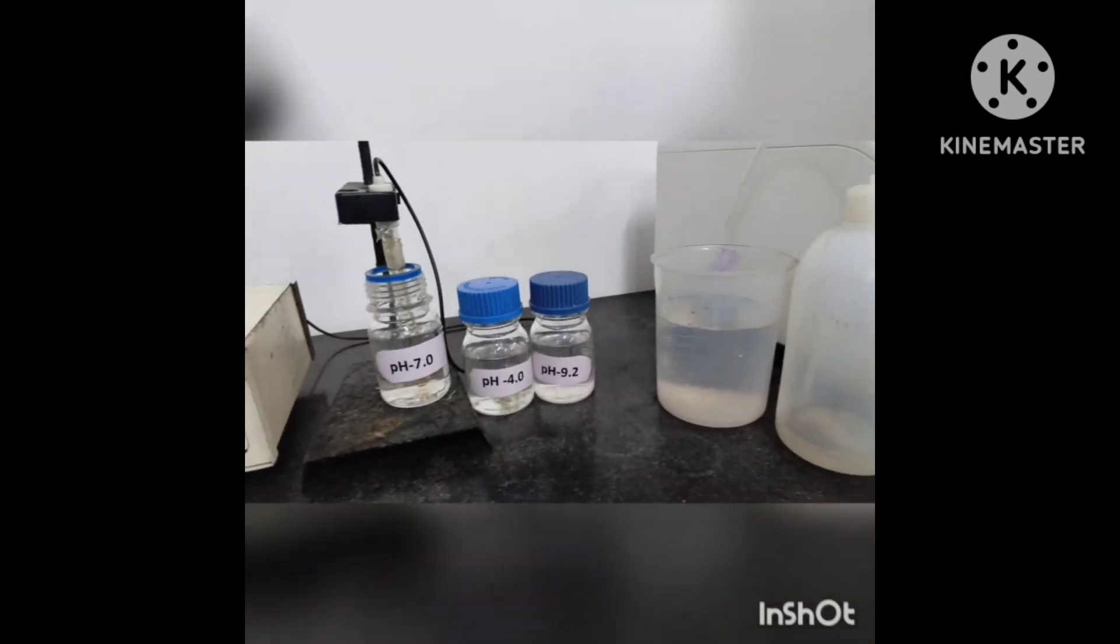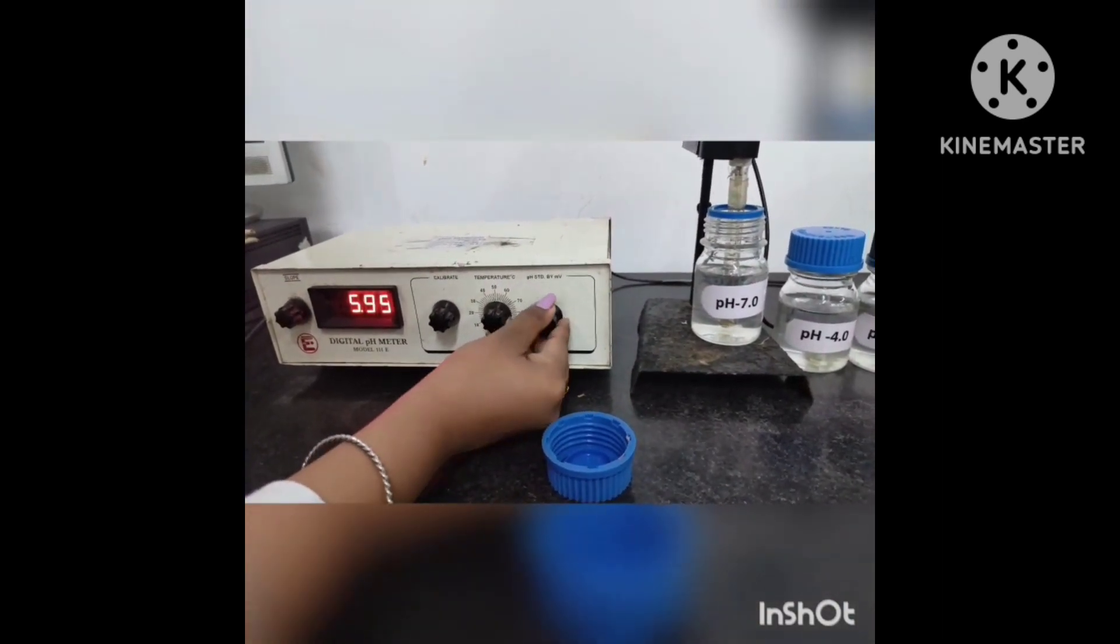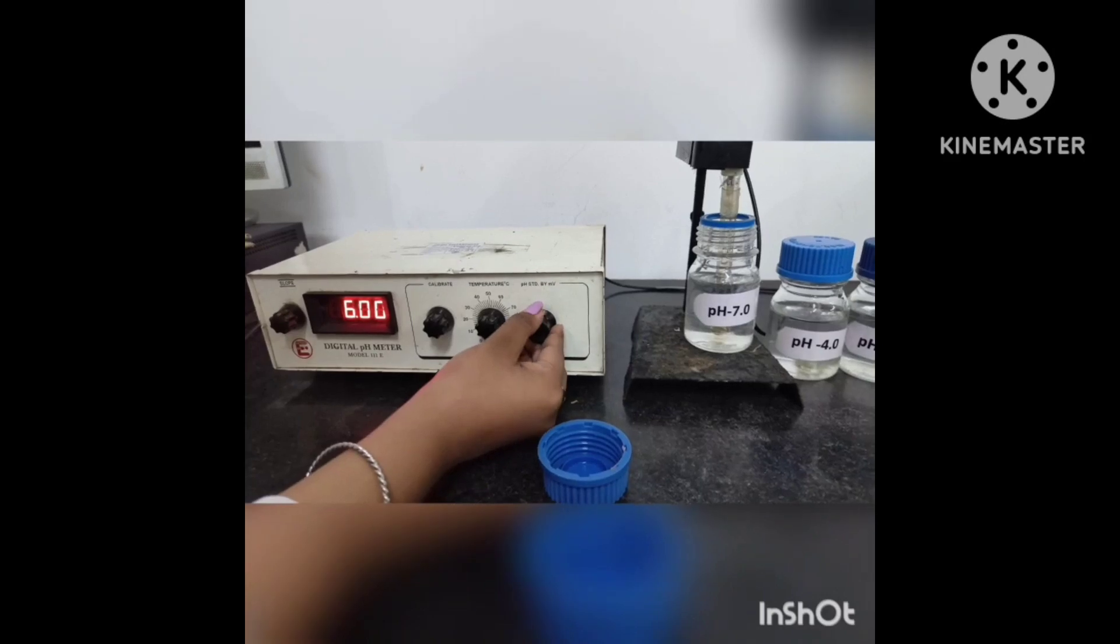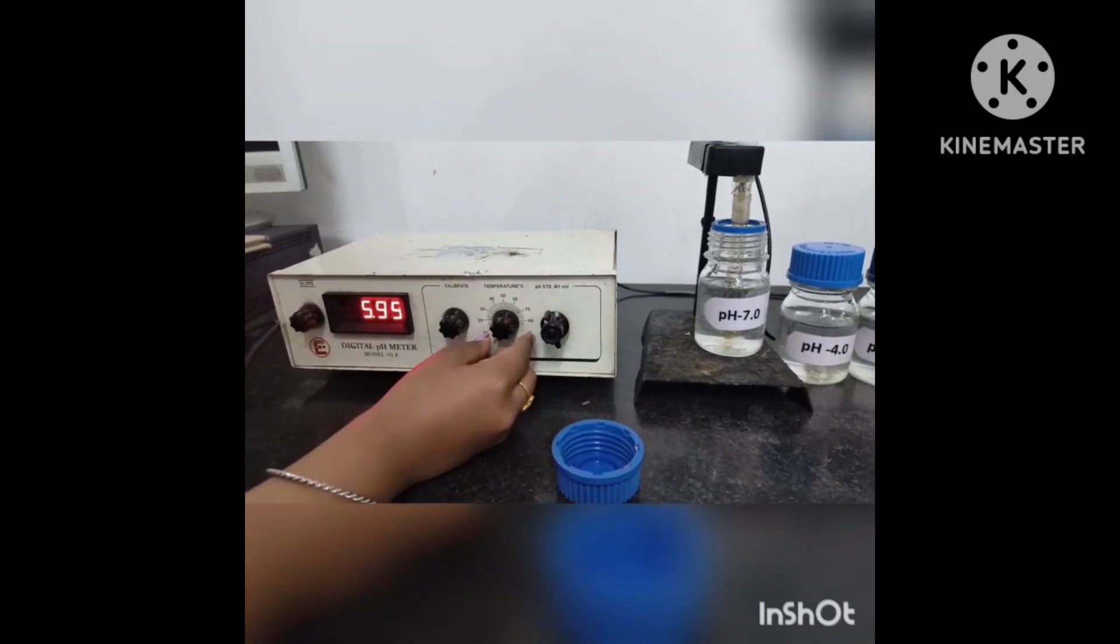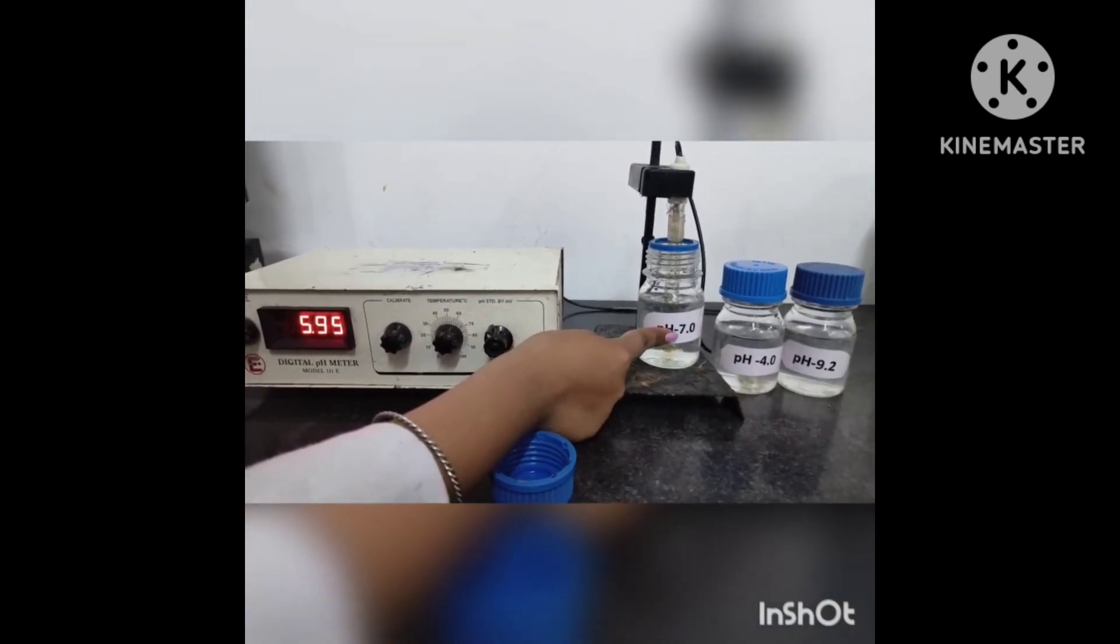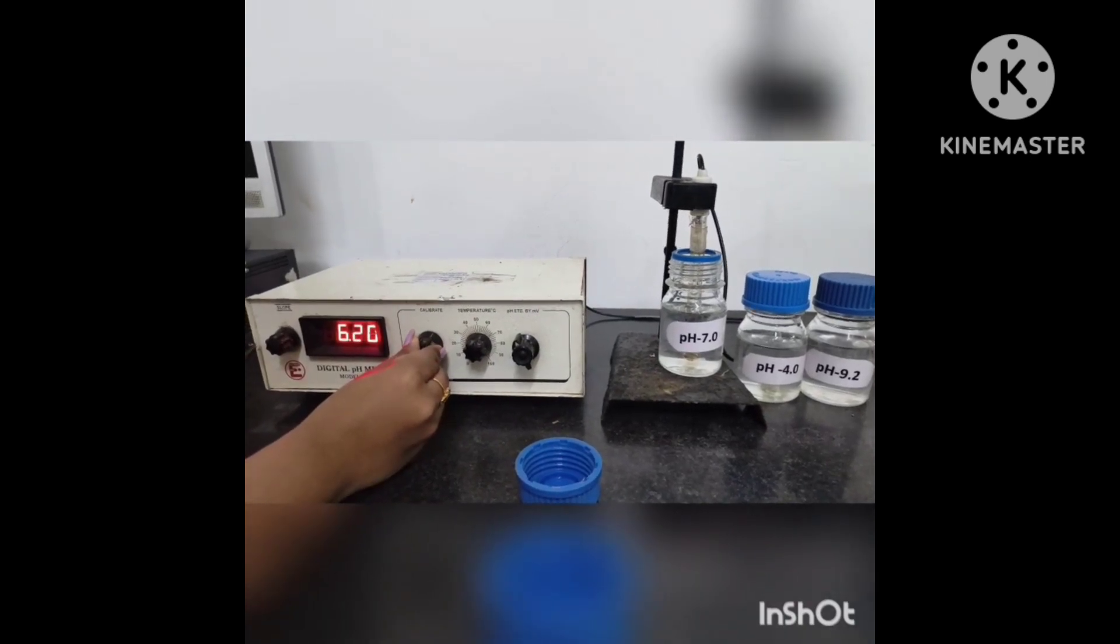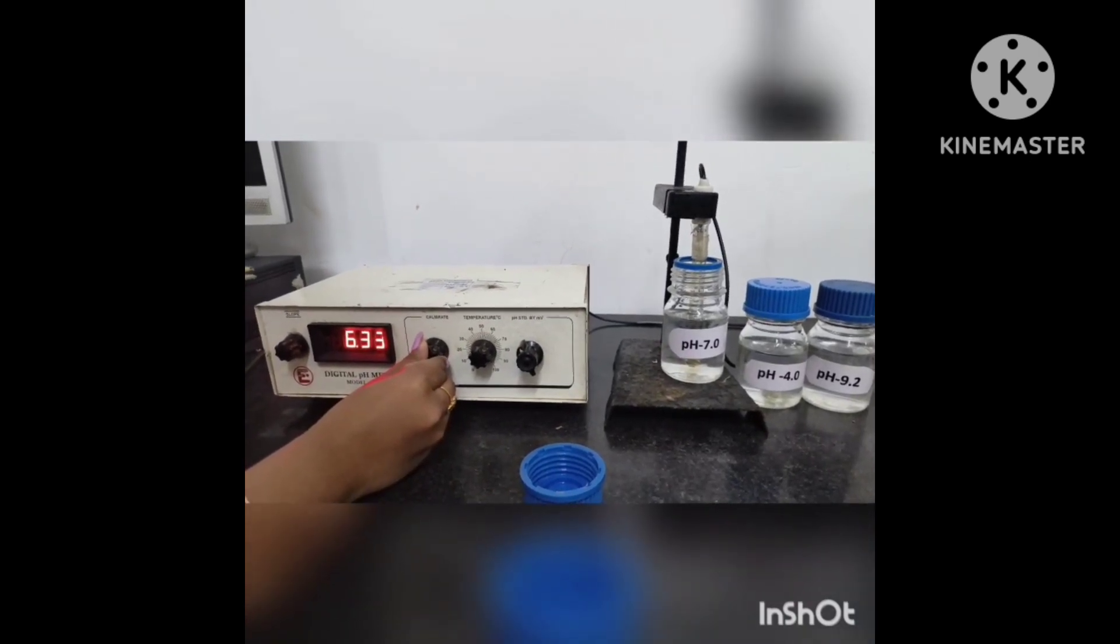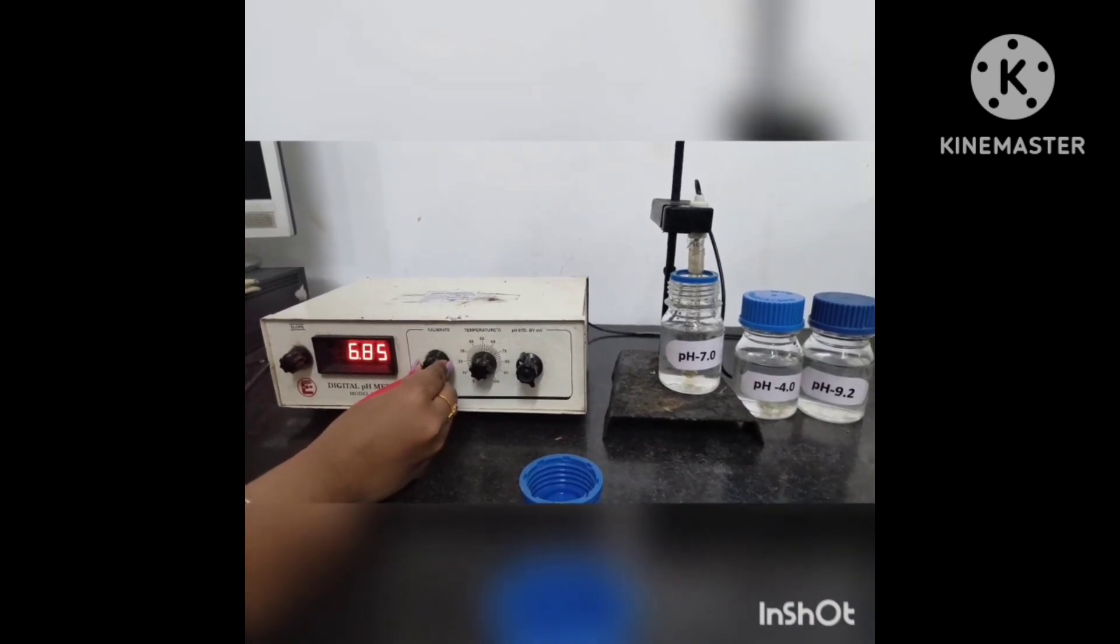The simple working of pH meter includes: First, the standardization or calibration of the pH meter. Second, dip electrode in the standard solution. Third, adjust the knob according to the known standards. Fourth, cross-check the standard solution for proper calibration. Fifth, dip electrode in the sample and note down the reading as pH.